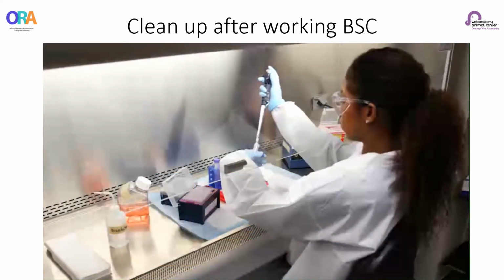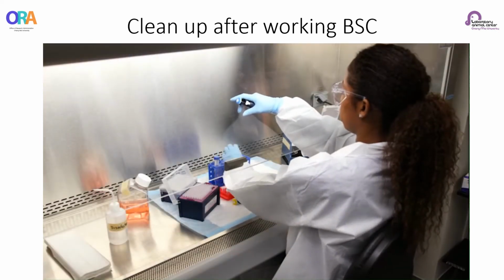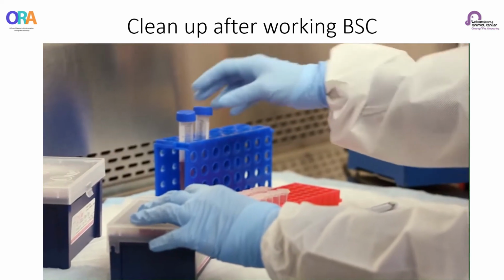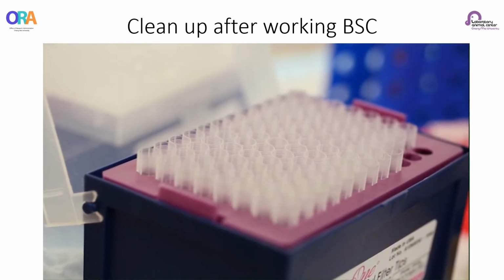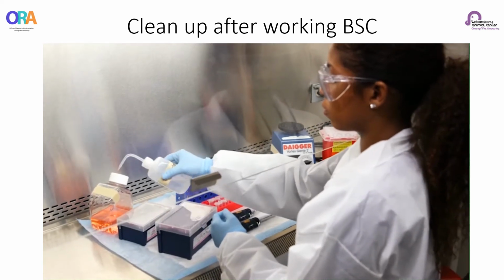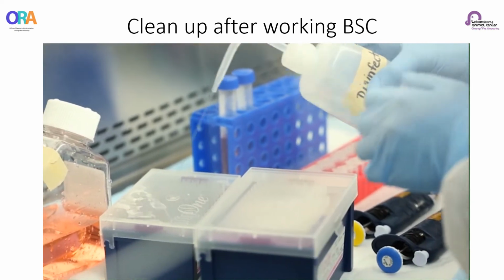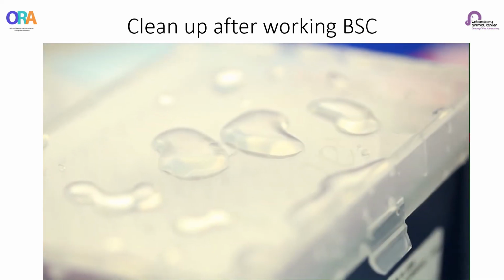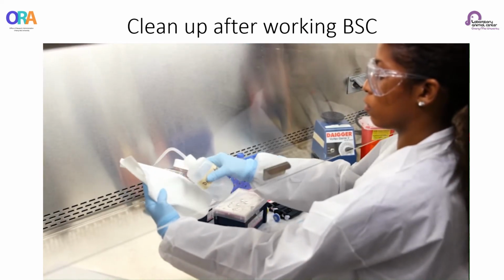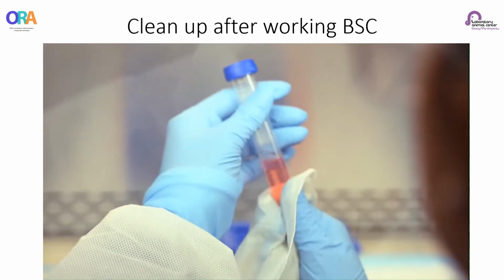Once you have completed your work, you will need to decontaminate all of the materials inside of the BSC and the BSC itself. This is all done while the blower motor is on. The first thing that needs to be done is close all the containers. Next, using the same disinfectant used to clean the cabinet before work started, generously apply disinfectant to the materials in the cabinet. This can be done directly to the materials, or by moistening a towel and wiping the surface of the materials, starting with the least contaminated items first.